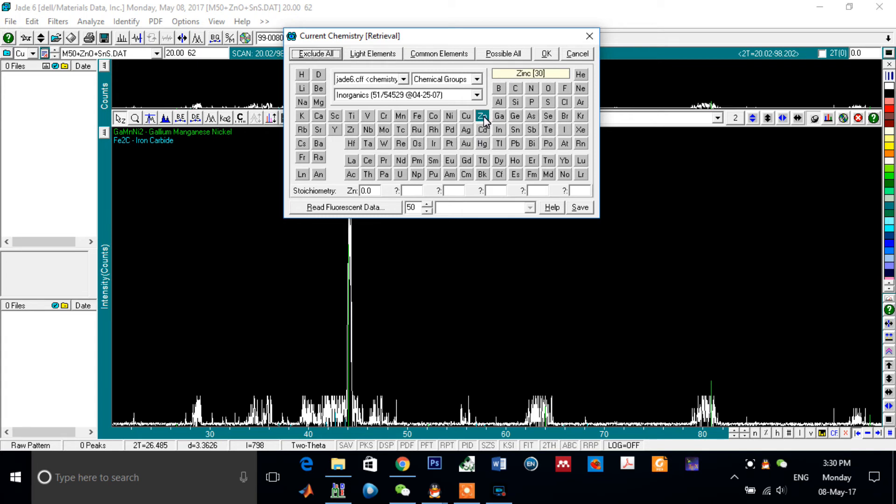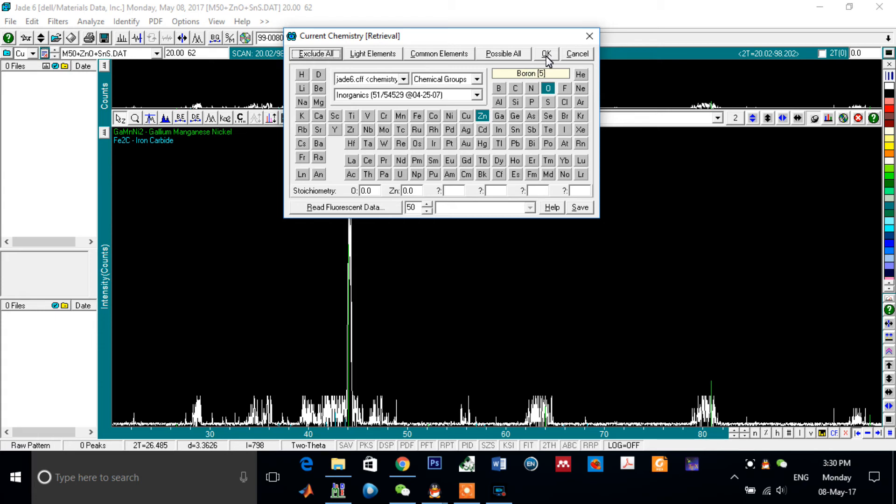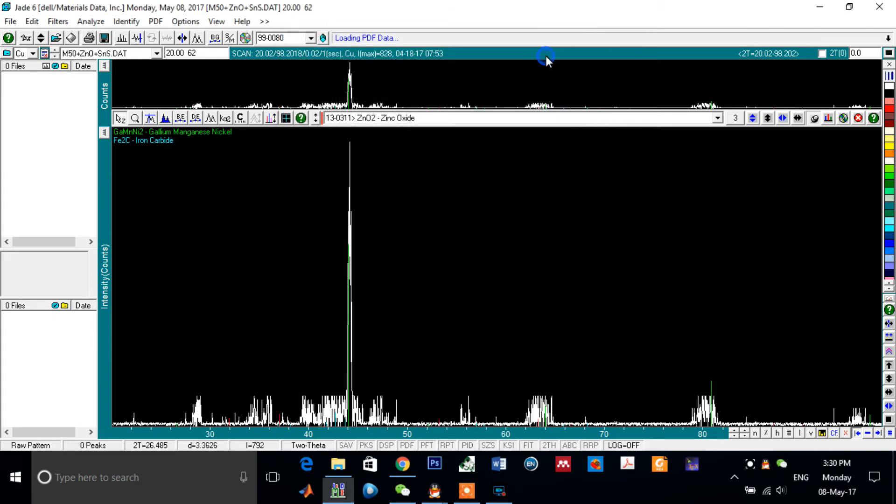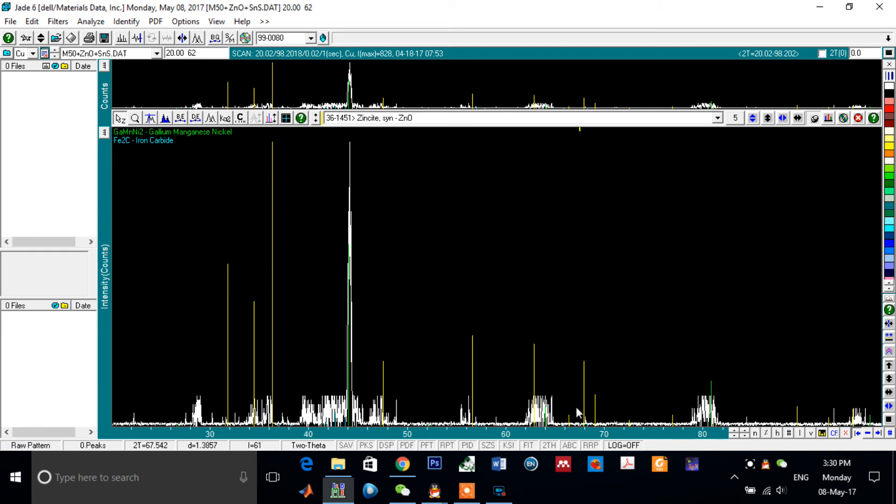For example, I want to check zinc and oxygen to know if zinc oxide can be found here or not. After that you can click on OK, and these are the peaks and the matching of zinc oxide.